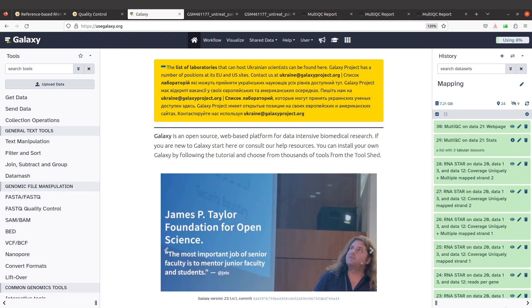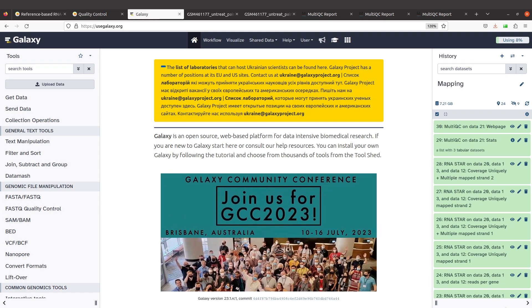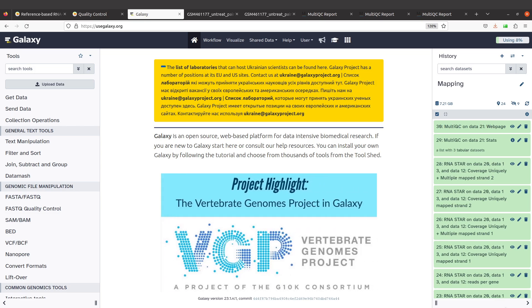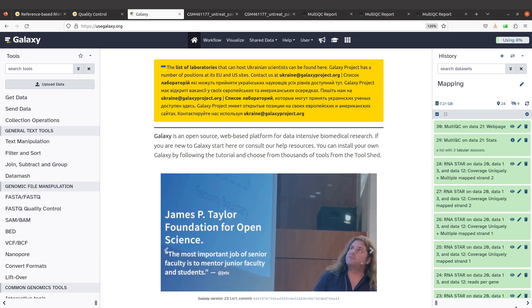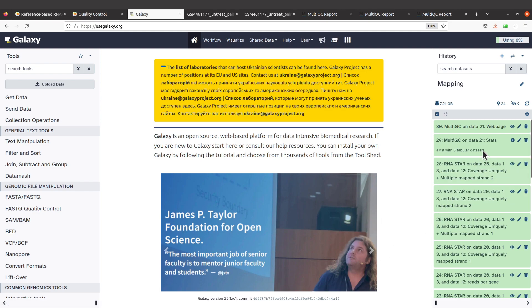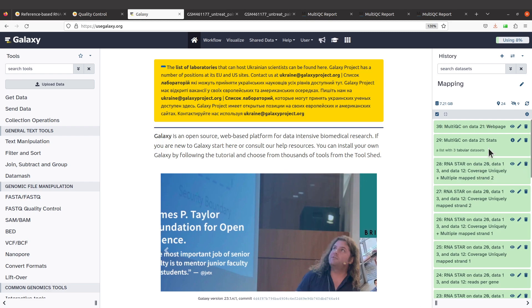Hi everyone, welcome to another tutorial session on RNA-seq data analysis. In today's tutorial, I'm going to show you how to use the Galaxy platform to generate the read counts using feature counts. This tutorial is a continuation of the earlier one on mapping, so I encourage you to watch that video if you want to follow along, as we are using the output from that tutorial here.